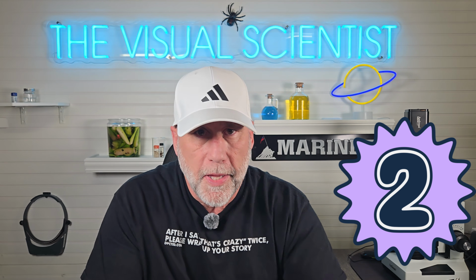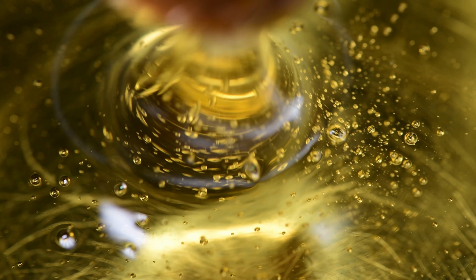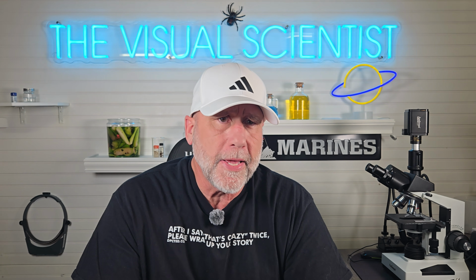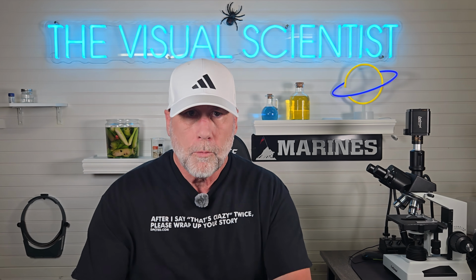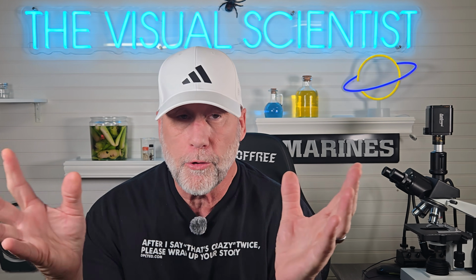Number 2, irregular crystallization. Real honey crystallizes because of a natural ratio of glucose and fructose. And those ratios vary because they come from different flower sources. That's why real honey crystallizes irregularly: non-uniform, jagged, uneven, natural. When you see perfectly uniform, perfectly geometric crystallization, that's a huge red flag.